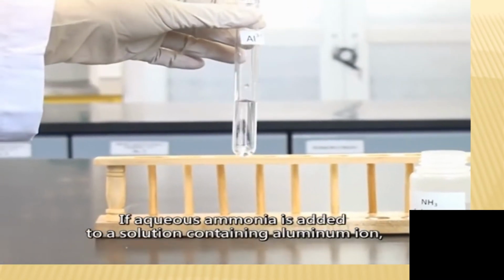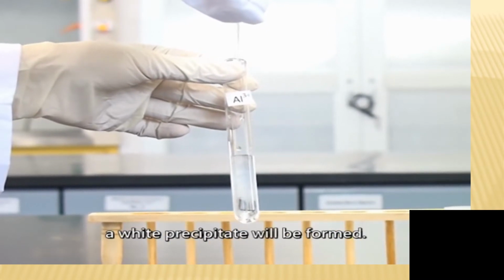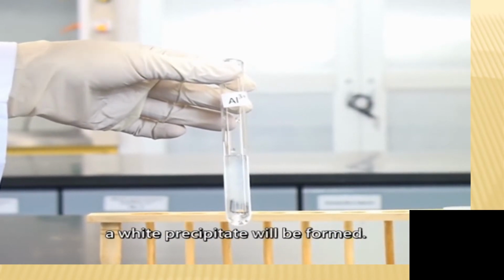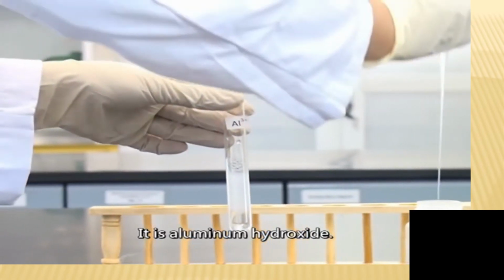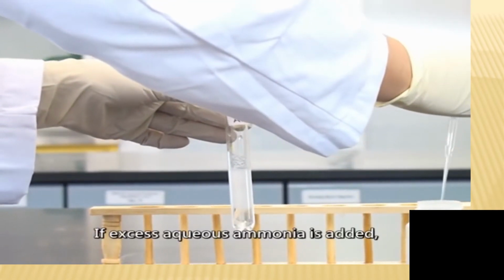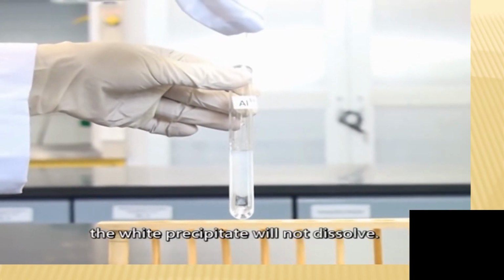If aqueous ammonia solution is added to a solution containing aluminium ion, a white precipitate will be formed. It is aluminium hydroxide. If excess aqueous ammonia solution is added, the white precipitate will not dissolve.